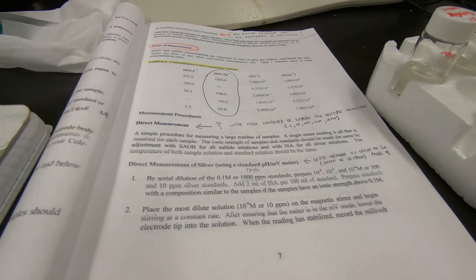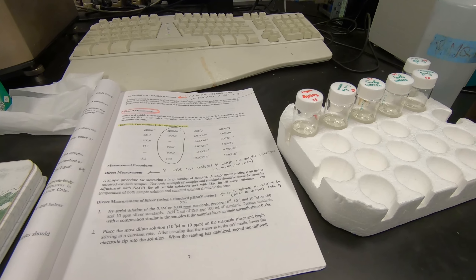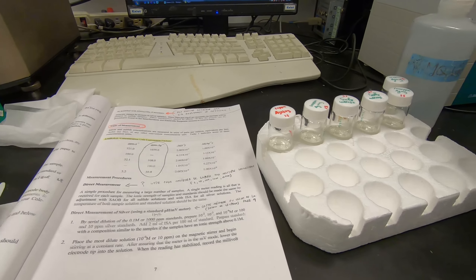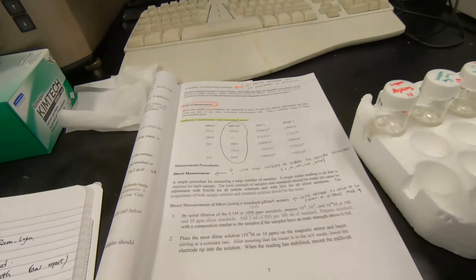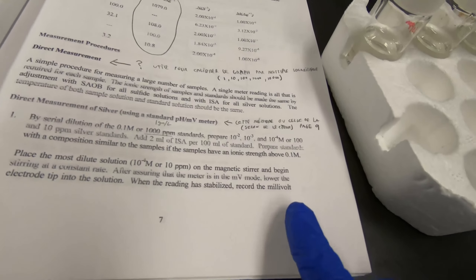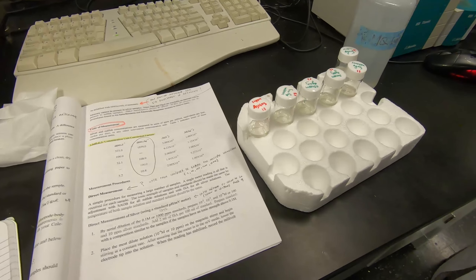I tested with and without the ISA solution and didn't see much difference, but for standard purposes I'm adding it all the time. These concentrations are different from the ones in the calibration shown earlier - it depends. We can prepare our own. Are we following the concentrations in the method - 10, 100, 250, 500 ppm - or using these concentrations? These are the input concentrations.